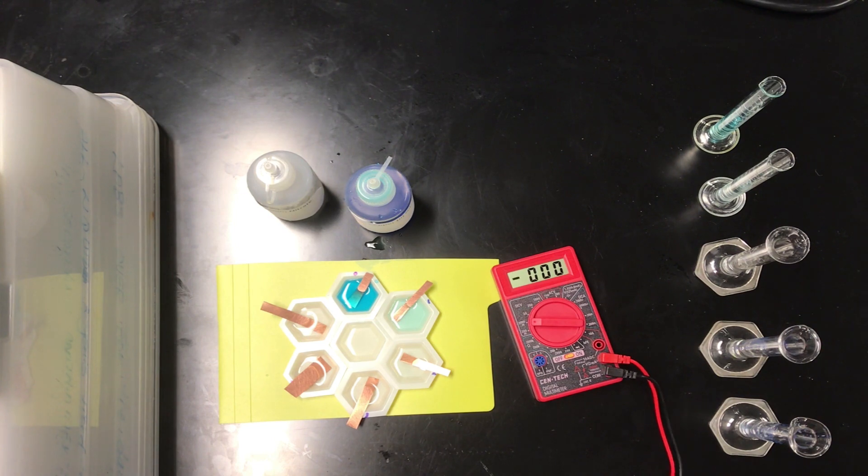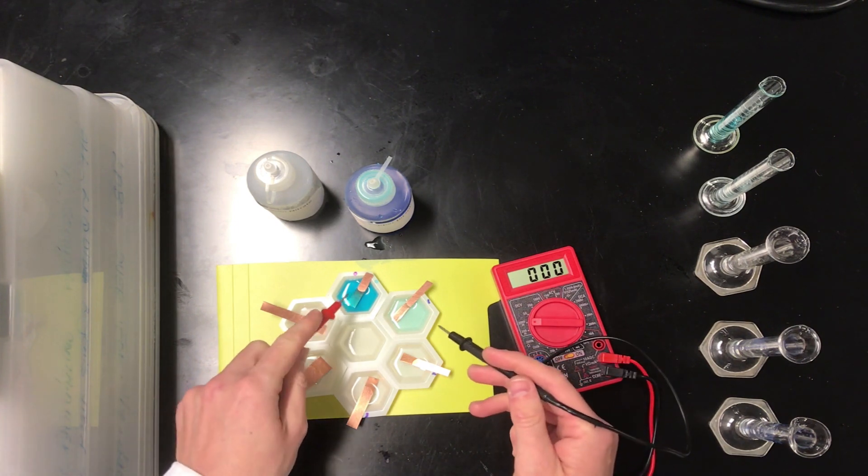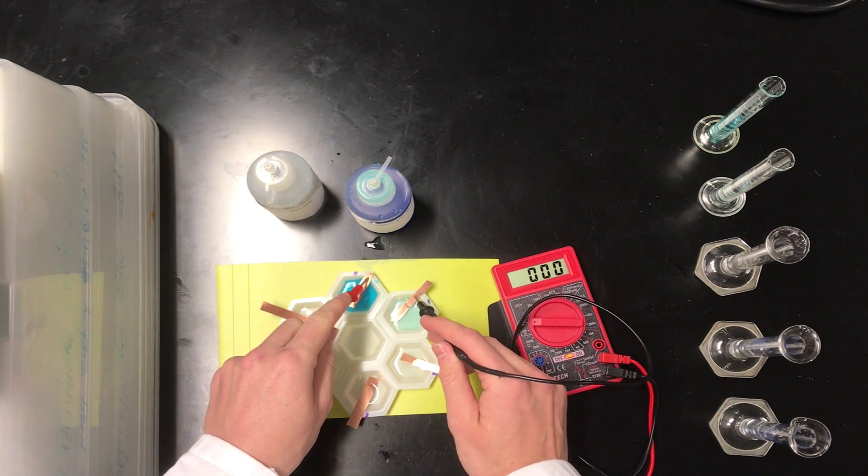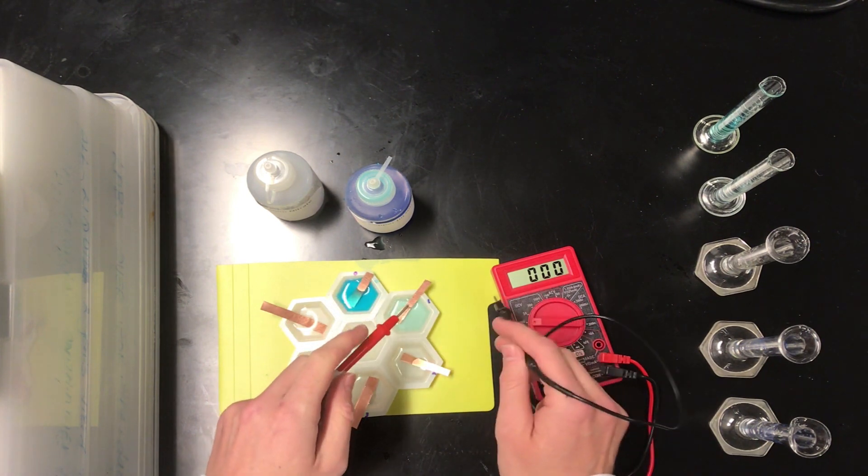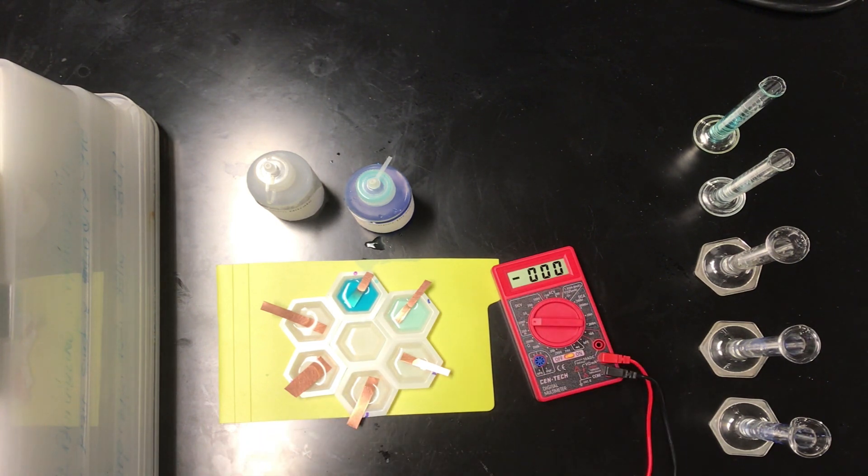Now the first thing I want to show you is that unless we connect these half cells via a salt bridge, no voltage is observed. So for example, if we connect the 1 molar half cell to the 0.1 molar half cell, a voltage of 0 volts is obtained, and you can see that on the voltmeter over here. This is reading in millivolts, a thousand millivolts corresponding to 1 volt of electrical potential difference.